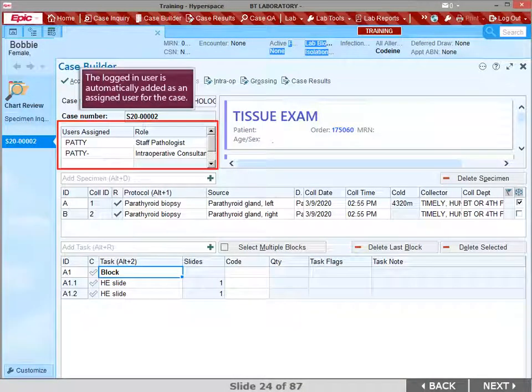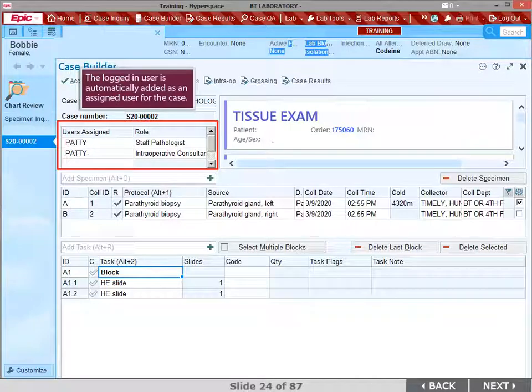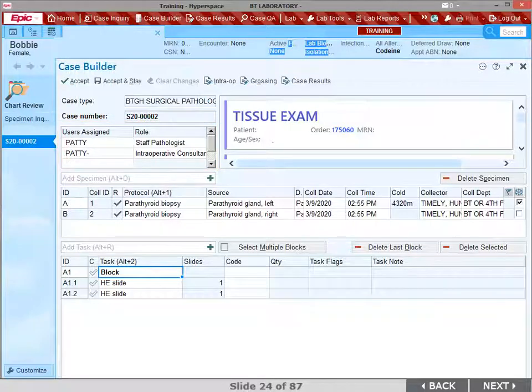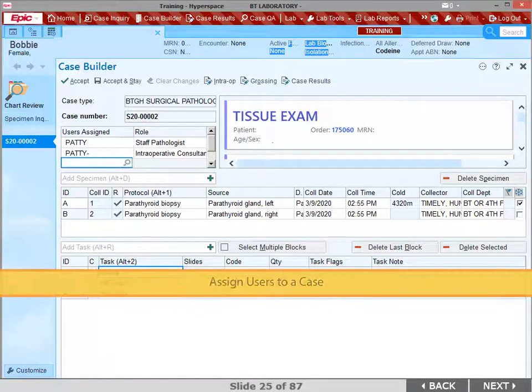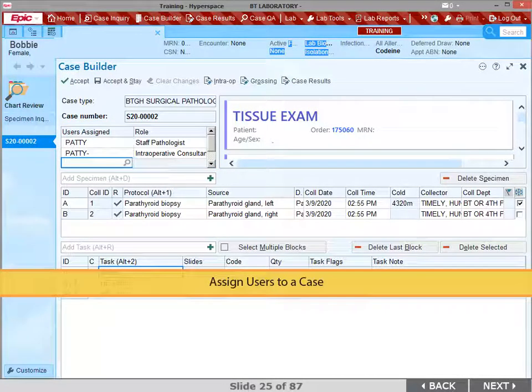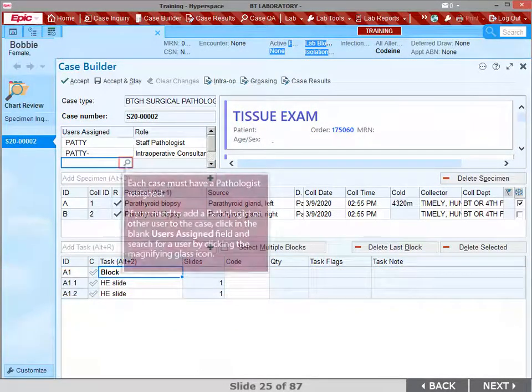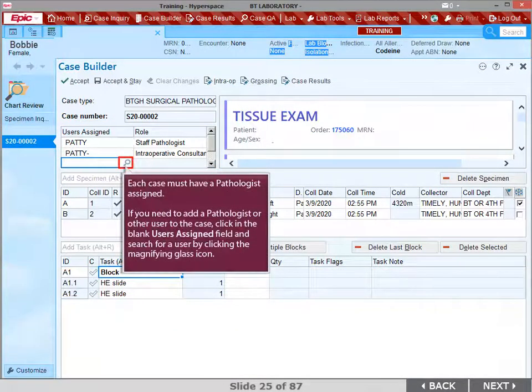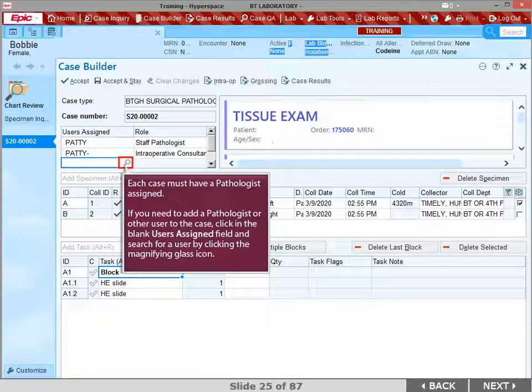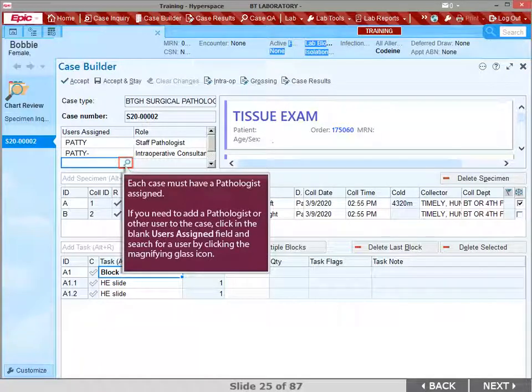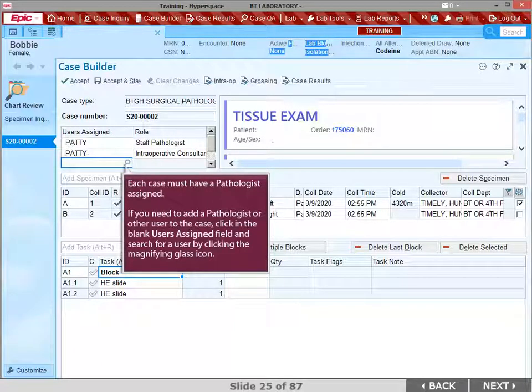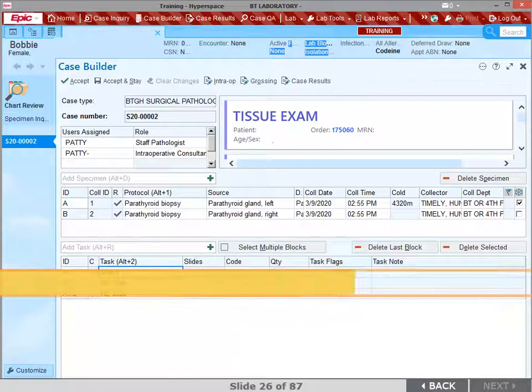The logged in user is automatically added as an assigned user for the case. Each case must have a pathologist assigned. If you need to add a user to the case, click in the blank User's Assign field and search for a user by clicking the magnifying glass icon.